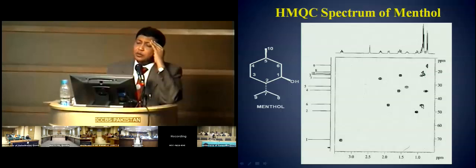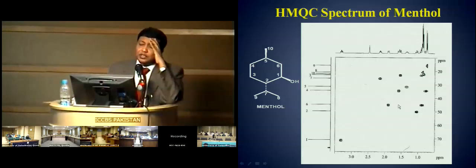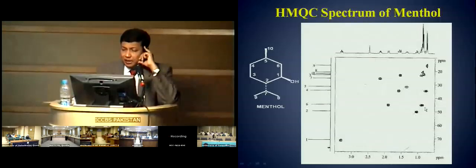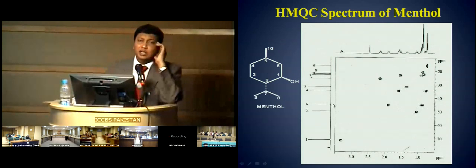This has two protons. One here, I'm sorry, this is C6. The C6 has two magnetically different protons, and they are a geminal pair, but both of them have a straight line with one carbon, right? This is really very simple: both of these protons, which are the geminal pair CH2 of C6, have the same line with the carbon, therefore they are the geminal protons of C6.